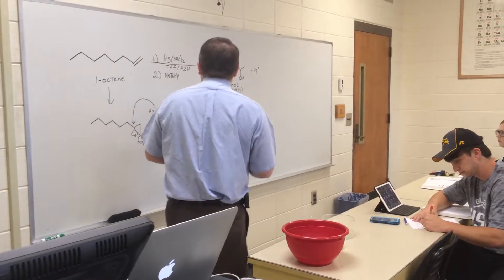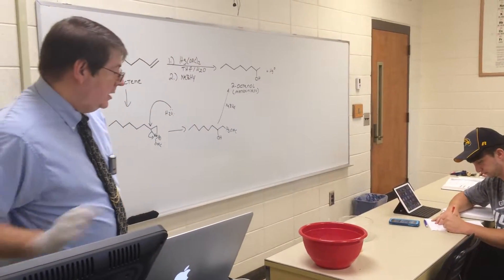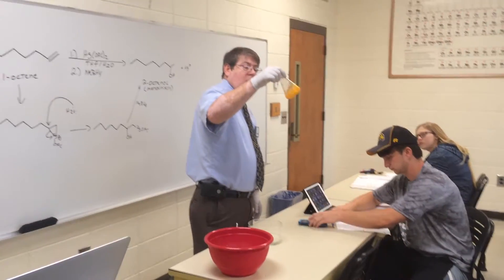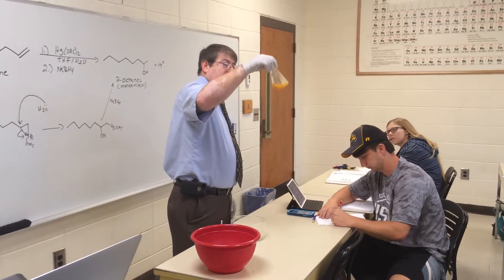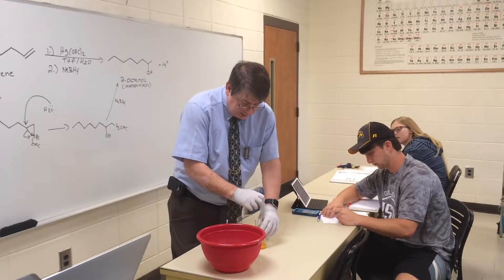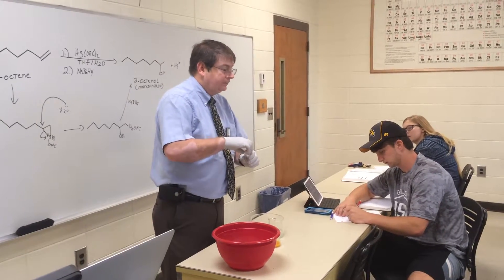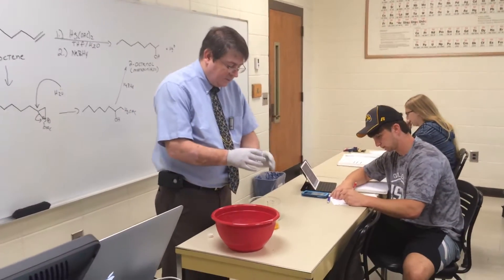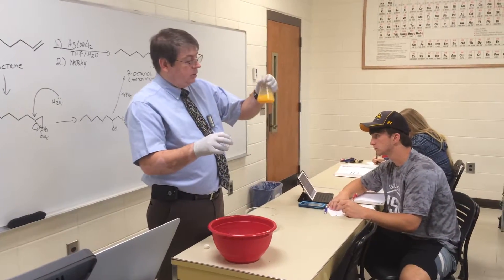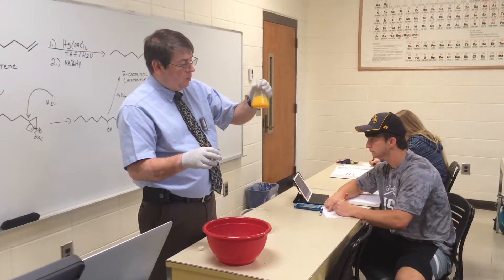That mercury metal is going to fall out of solution. So we're going to do this reaction as a demonstration. In this Erlenmeyer flask I have 20 milliliters of water with some mercury acetate in it — you can tell it's kind of orangish colored. To that I'm going to add 20 milliliters of THF. The purpose of the THF is to help everything be soluble, since THF is water soluble and will help make the solution homogenous when we add the 1-octene.